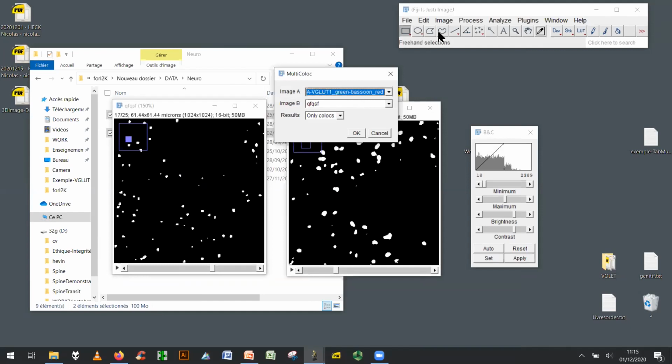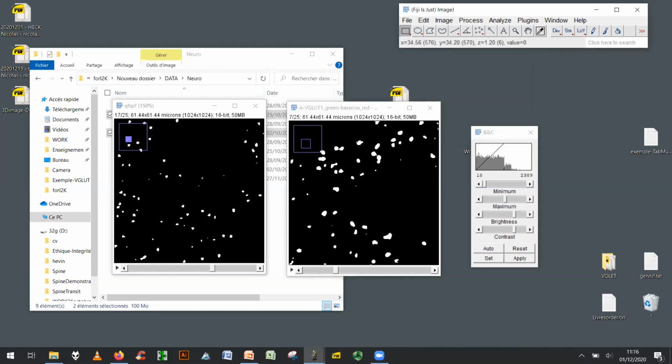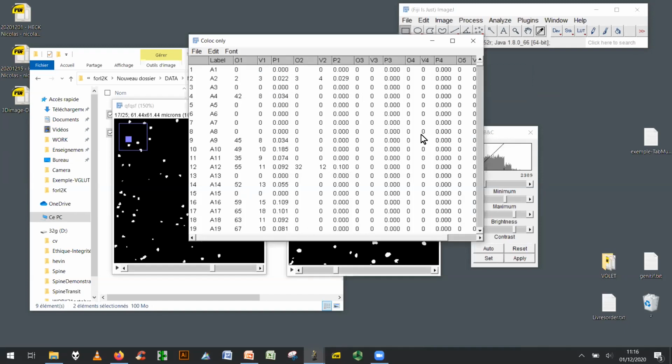I think there's a question. I just expand the window. Okay. Yeah, not for me. Or if you have it, you're lucky. Great for you. I don't have it. But okay, fine. Okay. So only collocs, all collocs, both. Let's say only collocs. That's fine for me. That's it.